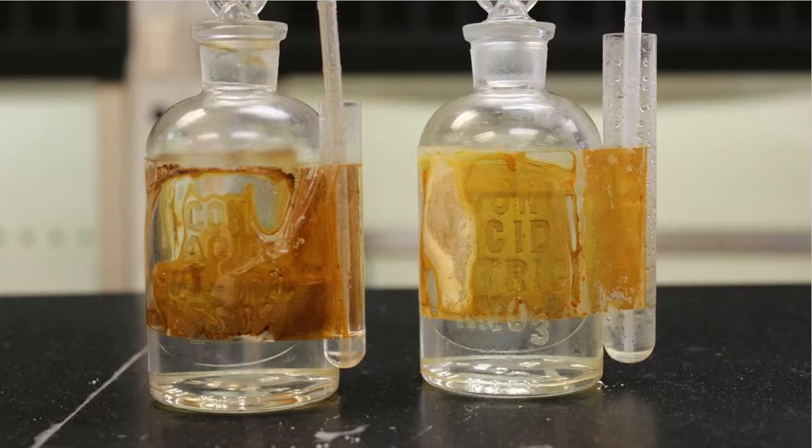We do not keep our concentrated acids in the regular huge 2 or 4 liter jugs. This is just way too big. If someone breaks a 2 liter or 4 liter jug, folks, where do you think it's going to go? It's going to go all on the floor, and I don't want it all on the floor because I don't want to clean it up. So we pour these in smaller containers for you to use.